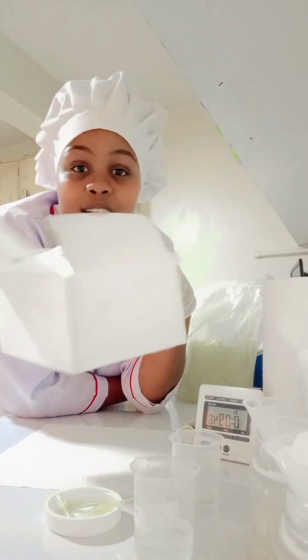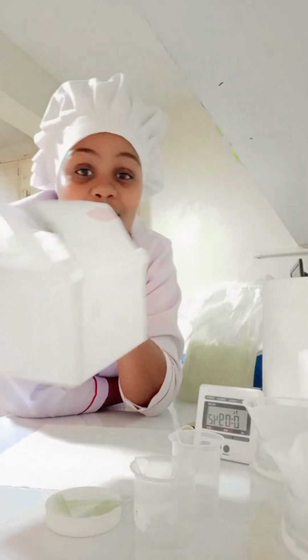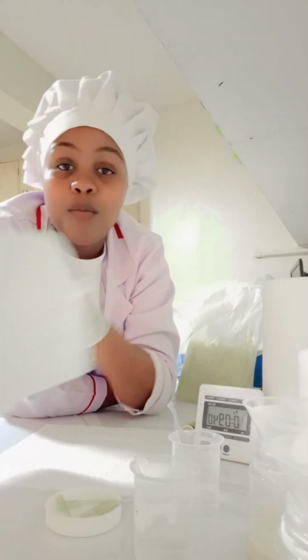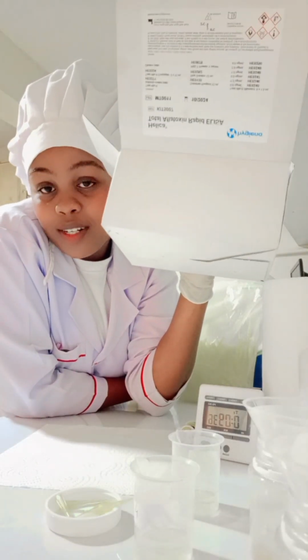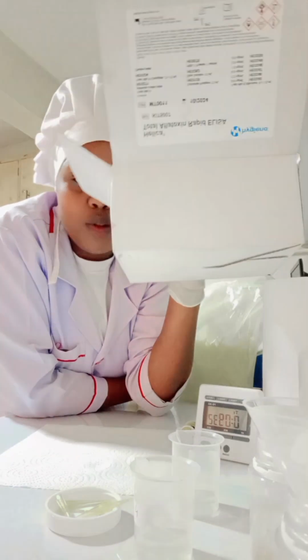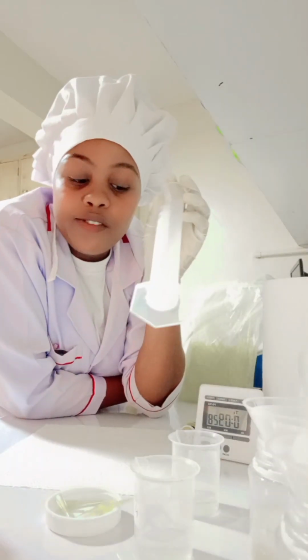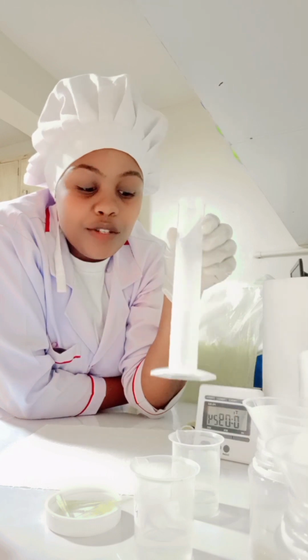It's very expensive, very expensive. Imagine in Kenyan shillings, you don't know how much this thing costs. For those who run the test, they understand how expensive this thing is. That's what I was actually explaining here. So that's why we are being told to avoid contamination at all costs. Now that's our measuring cylinder.